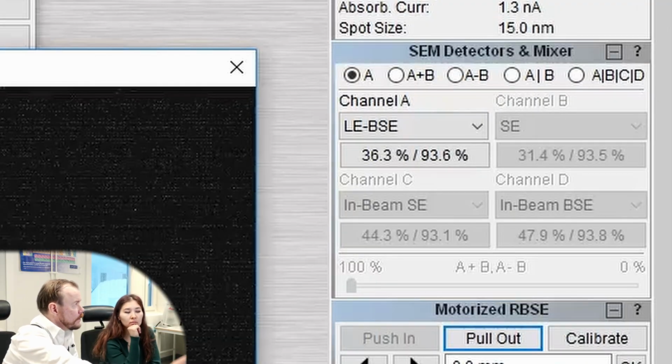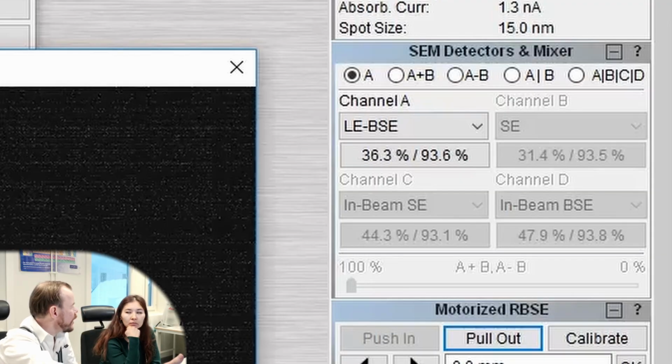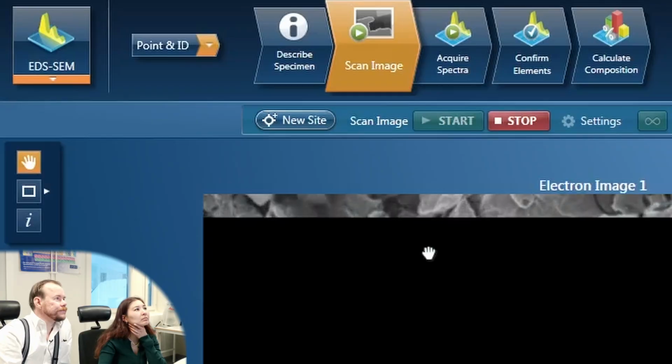But in the Tescan microscope, you can choose whichever detector you like on whichever channel you like. So in the EDS software, it would have been more correct if it said channel A and channel B. So even if it says SC in the EDS software, it is channel A it refers to, which will be the backscatter signal. So you keep it on SC. We only want SC, otherwise you get 2 images. You can close that and click start, the green button there.